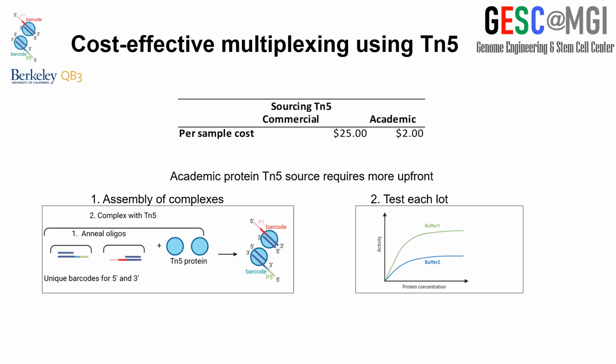Switching gears to multiplexing, Tn5 is a lot more amenable to high throughput because Covaris g-tubes aren't supplied in 96-well format, and so it is not as amenable to high throughput as Tn5 is when you may have dozens of samples that are required for tagmentation or fragmentation and barcoding. The per sample cost can be high, however, and so if this is performed a lot in a lab, using Tn5 from an academic source or made in-house can circumvent that cost.